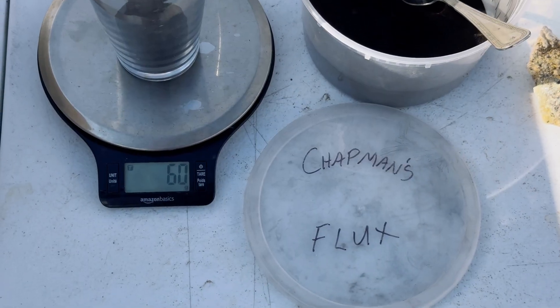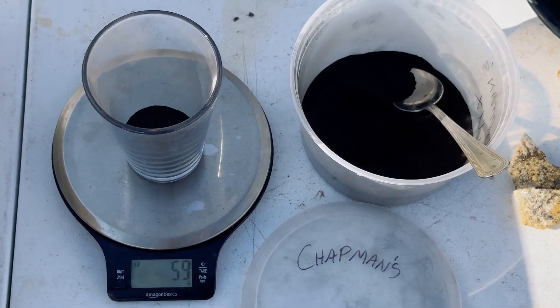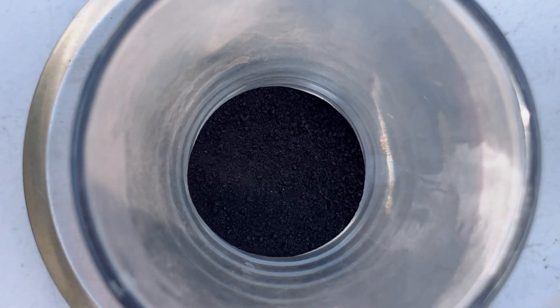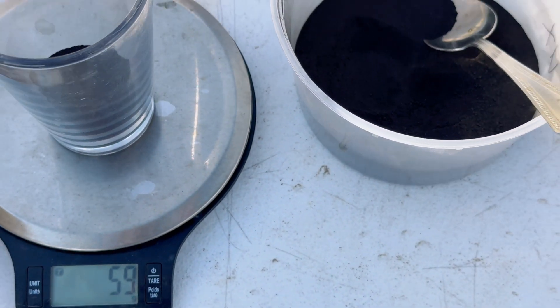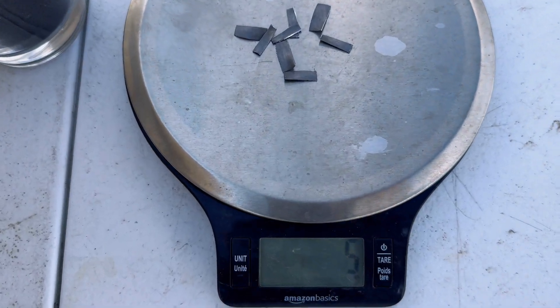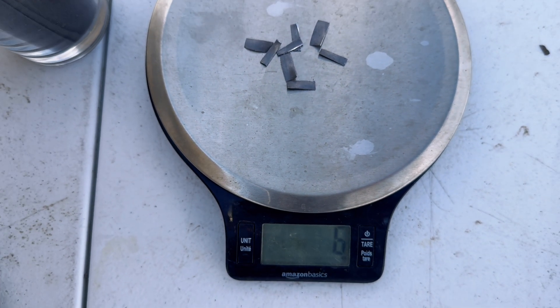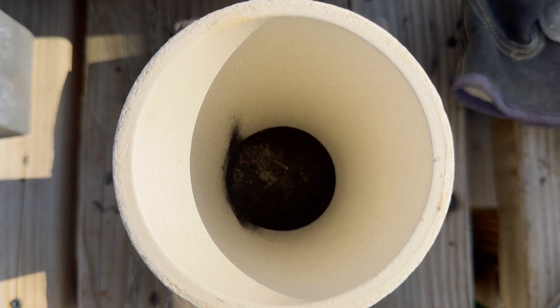For this smelt, we are going to use 50 grams of Chapman's Flux. The ingredients that make up Chapman's Flux are 40% anhydrous borax, 20% silica sand, 20% manganese dioxide, and 20% soda ash. In this fire assay, I am going to use 6 grams of lead and not use any litharge. We have our concentrate and flux in our crucible.